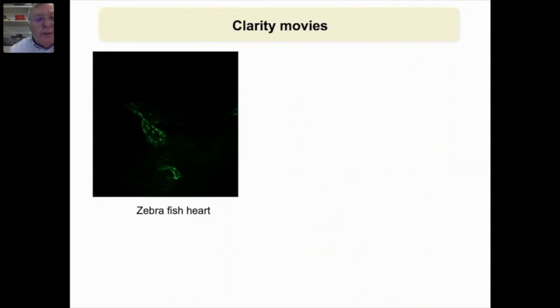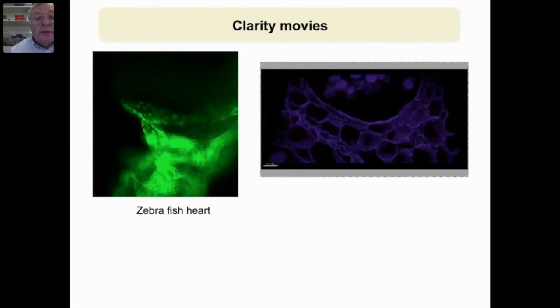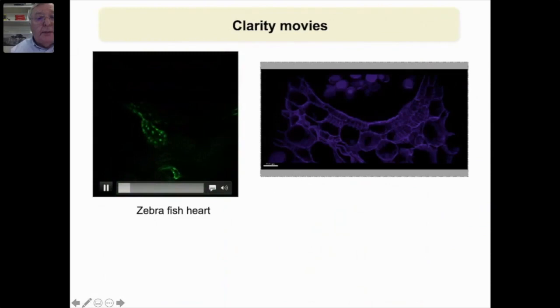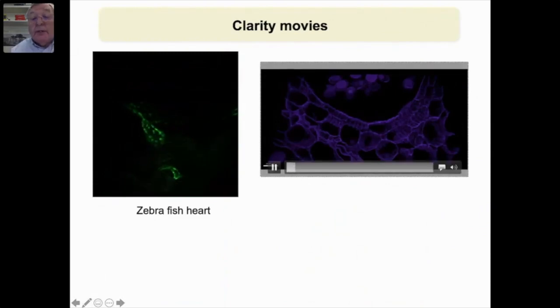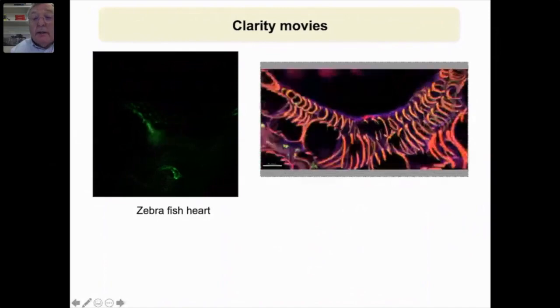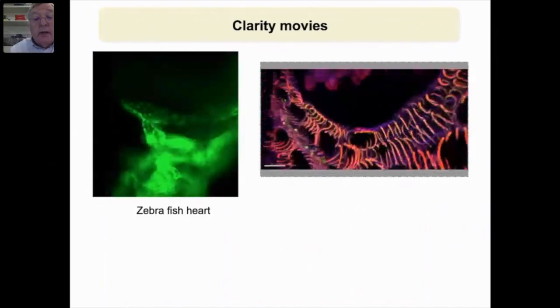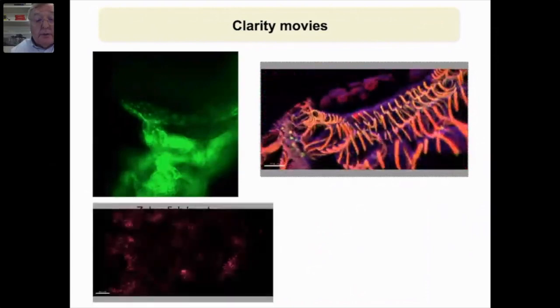Now, the other thing the Clarity can do, apart from the conventional, is take the confocal. So what was being shown to start off with was the confocal image, and then switching to the conventional a bit later on. More of these videos, because they're quite pretty. This is a brassica thing. You can get these really rather nice three-dimensional images, and more and more.